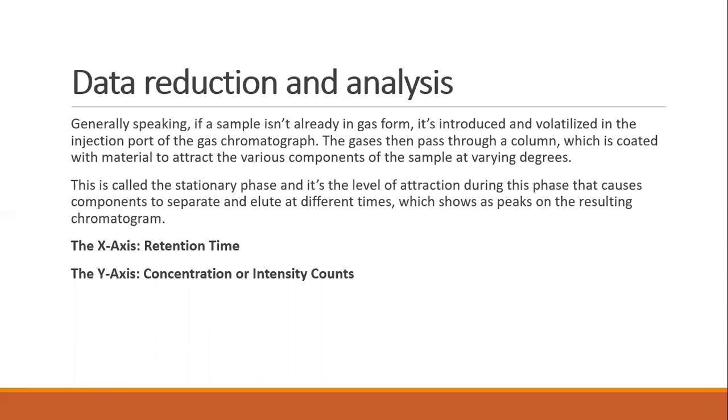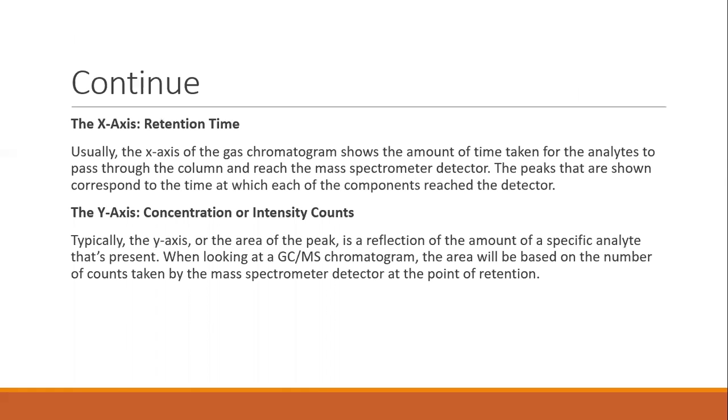The relative response factor is the expected ratio of an analyte to an internal standard or external standard, and is calculated by finding the response of a known amount of analyte and a constant amount of internal standard, a chemical added to the sample at a constant concentration with a distinct retention time to the analyte. Here is one of the examples.